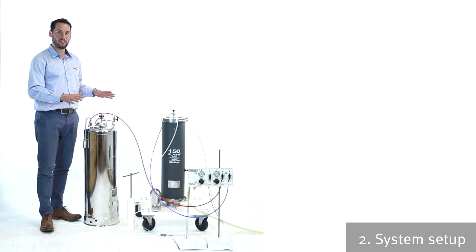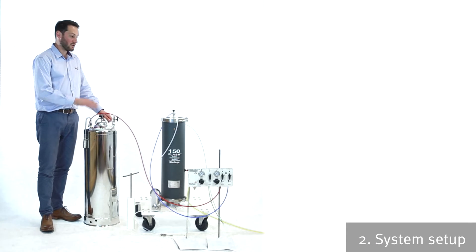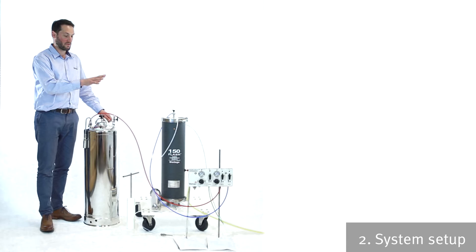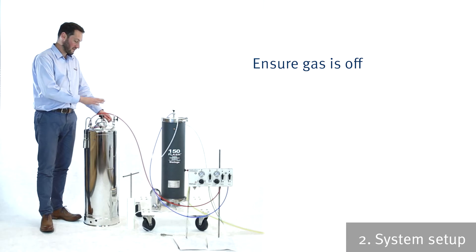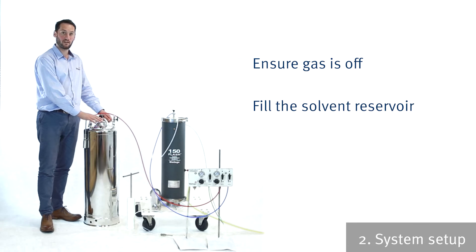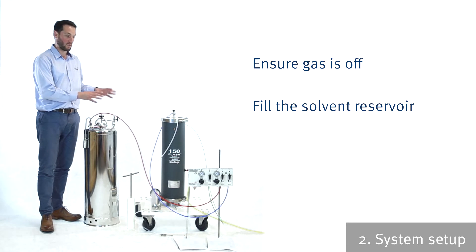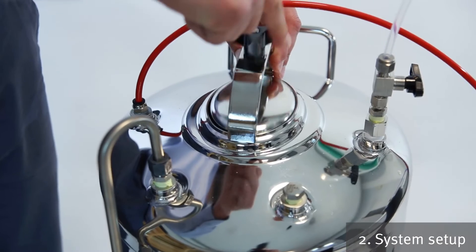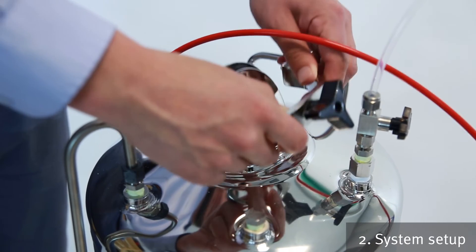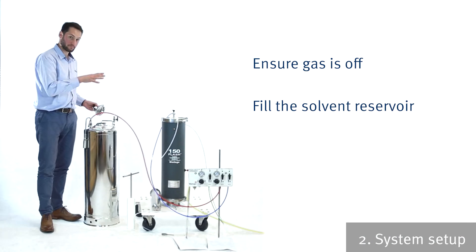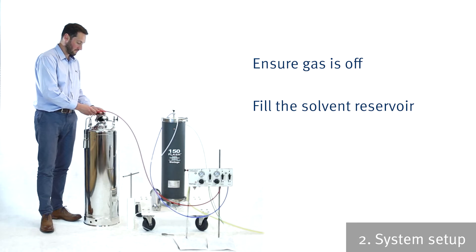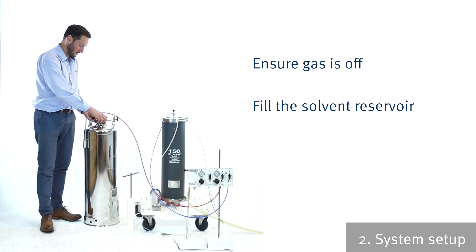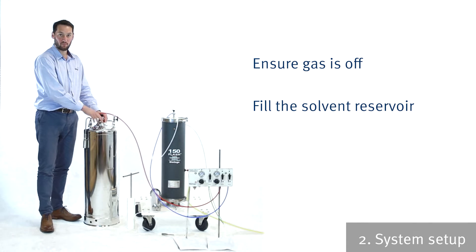So once the work area is prepared and you're ready to start the chromatography, just as a safety precaution, make sure that all the gas is turned off. First thing to do is to fill the solvent reservoir with the solvent that you're going to use to equilibrate the cartridge. So the first thing to do is open up the top. Comes off like so. The solvent goes into the container. The lid goes on.